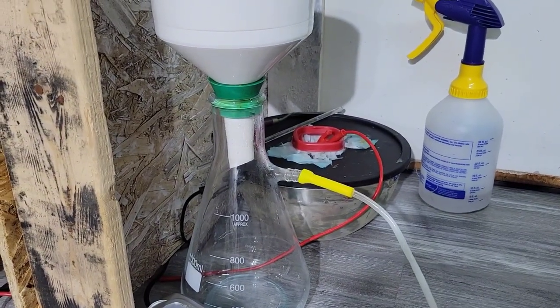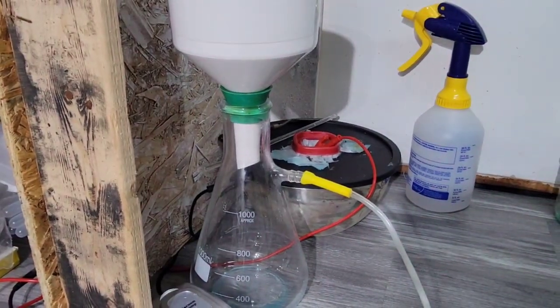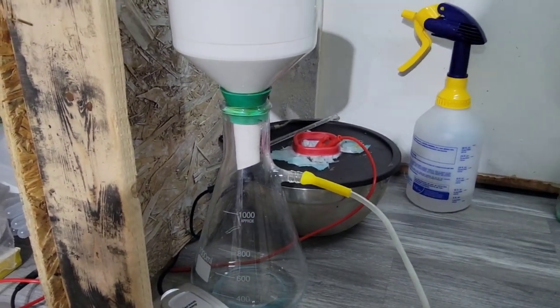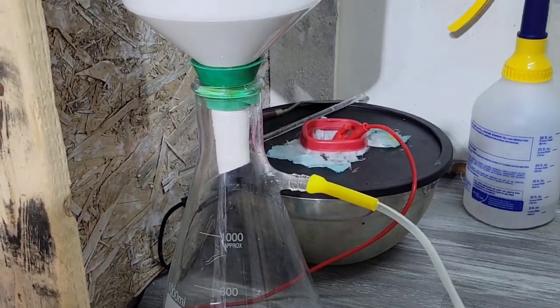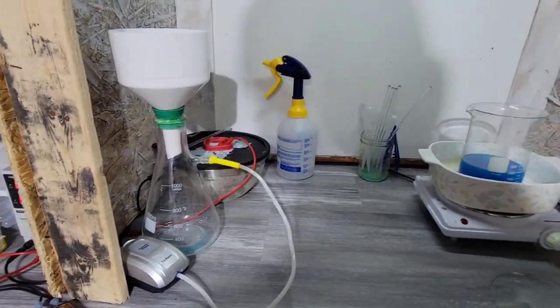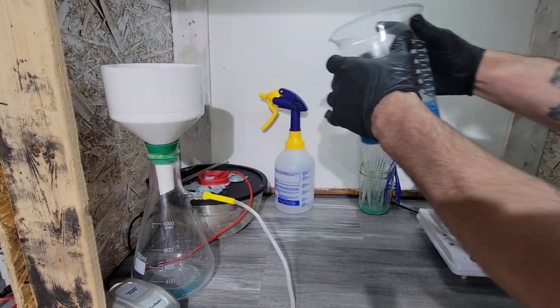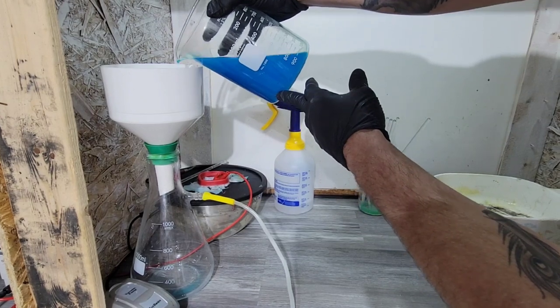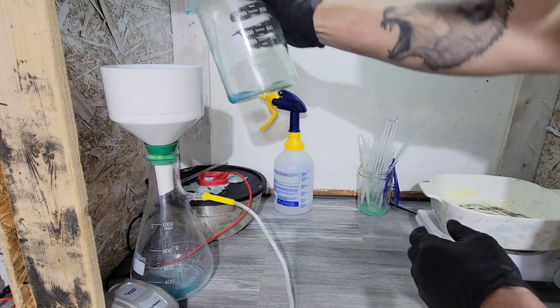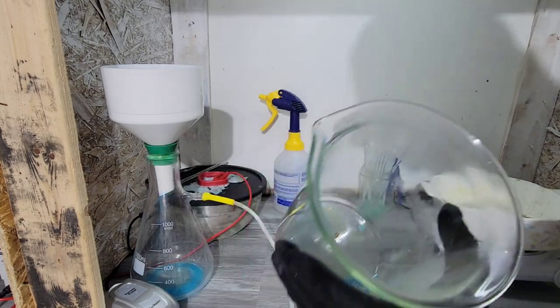And we're gonna go with a little different view here. Let's see. Other way, there we go. Filter out our solution. See our gold flakes? I'm really glad we did that.